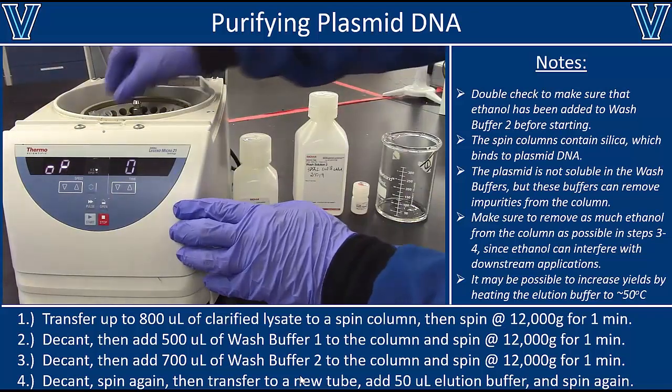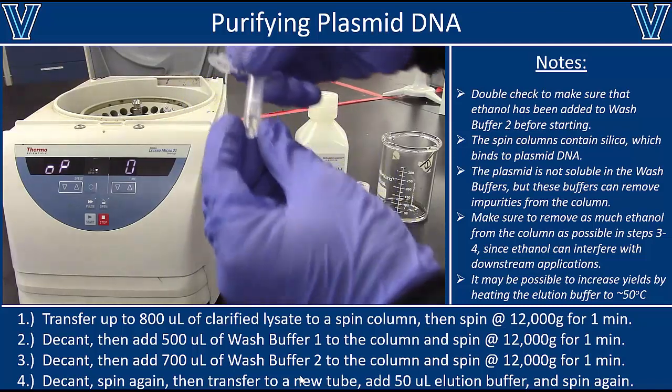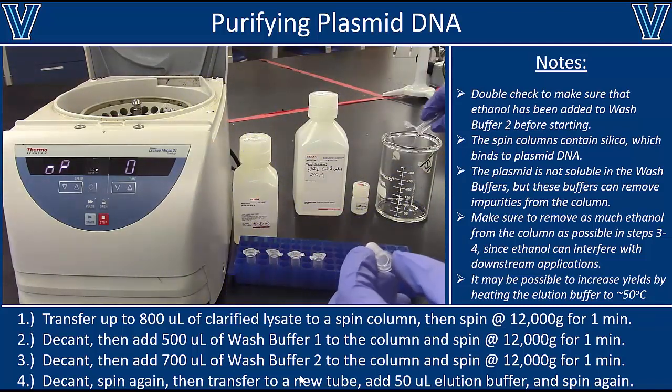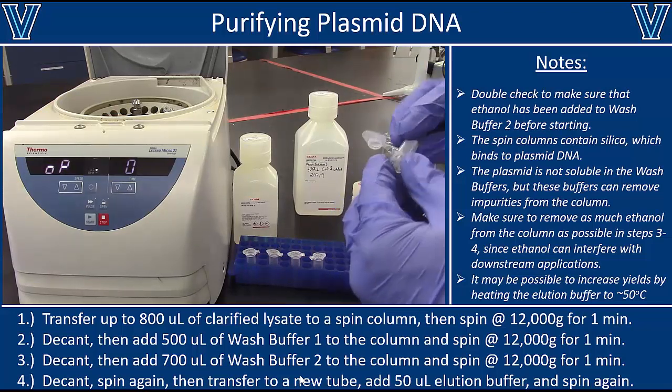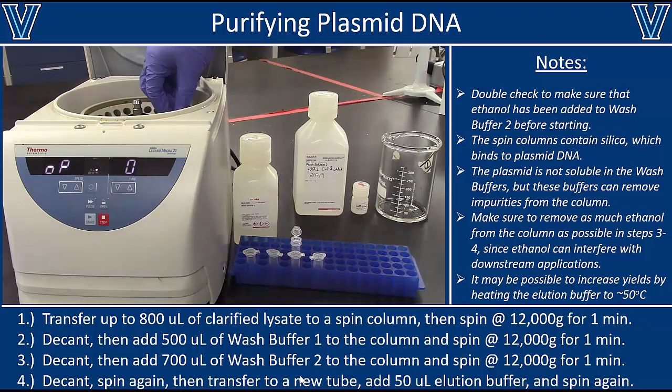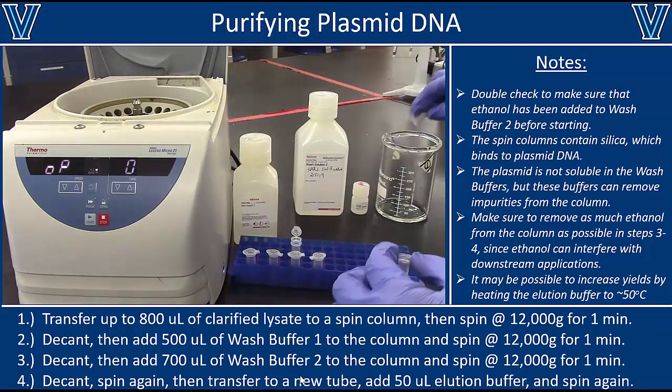All right, I feel like I'm repeating myself here, but once again, you'll take the tube out, your liquid will have gone through the column to the bottom of the tube, and you're going to decant that into the beaker there, and you're going to do that for all of your samples.